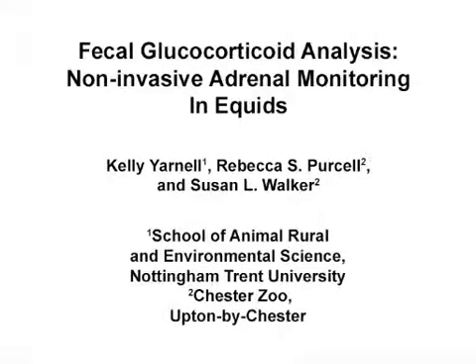The overall goal of this procedure is to demonstrate how adrenal activity can be assessed non-invasively in equines through the extraction and analysis of fecal glucocorticoid metabolites.